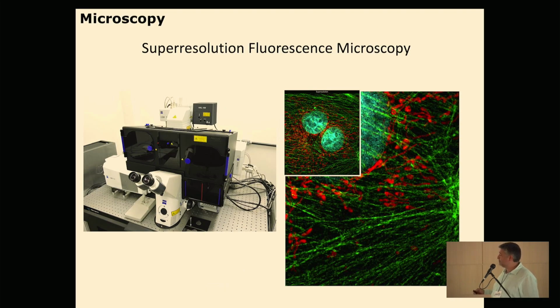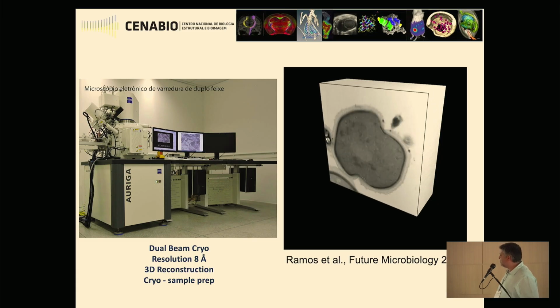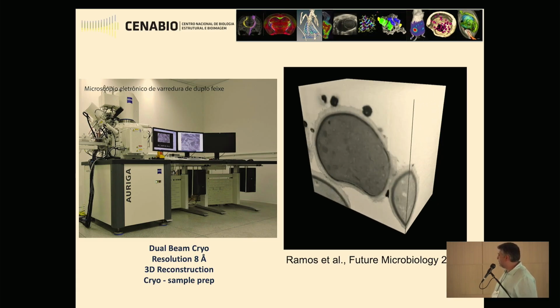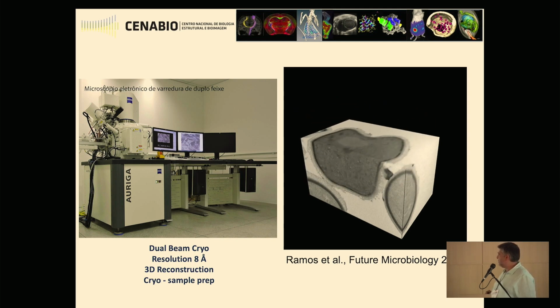We want to highlight these two microscopes. First, the super resolution that is working well in our facility also. And this Auriga also that was published years ago, this beautiful image reconstruction in our facility.